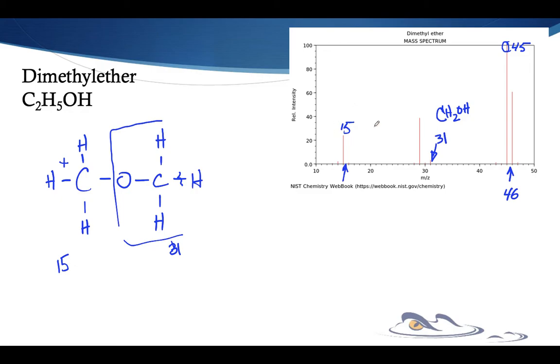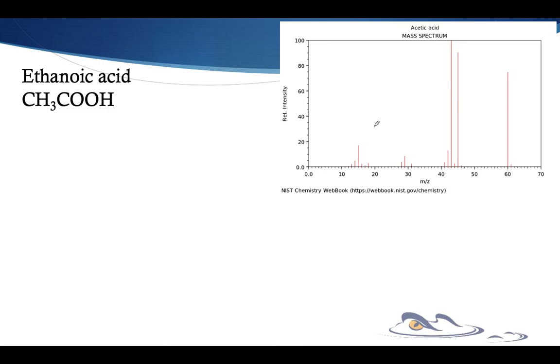So again, are you as an untrained person going to be able to make sense out of every little piece in this spectra that you get? The answer is no. We use each of the little pieces to try to make some sense out of it. We use some historical information, like I recognize this as an alcohol. This is the way alcohols tend to break apart. And this is the way ethers tend to break apart. So it's a lot of experience in a lot of different ways, but we're just looking at another one of those pieces.